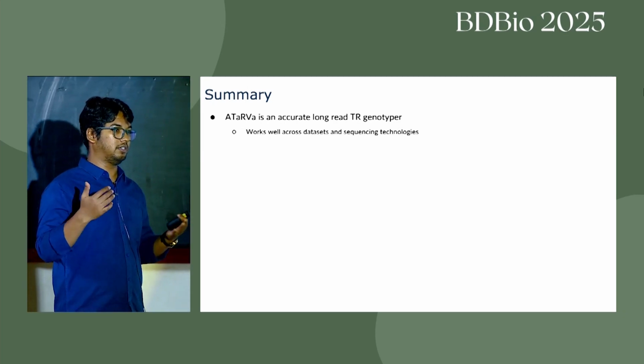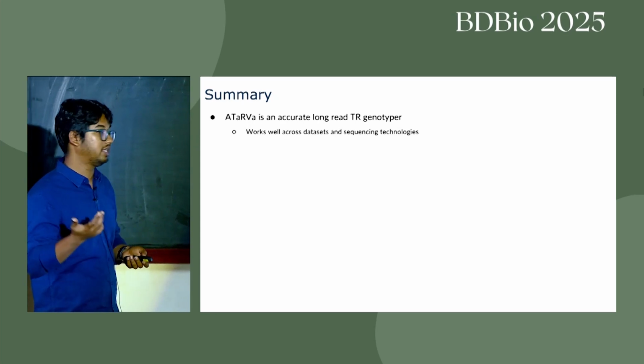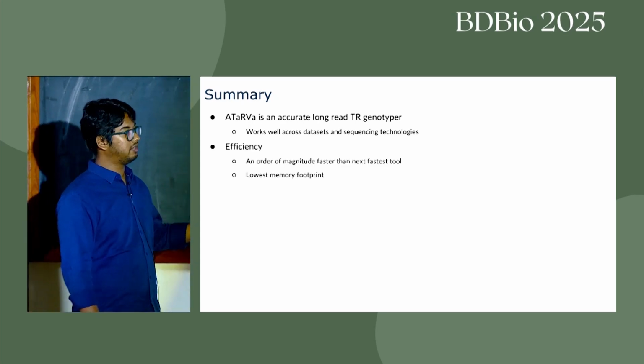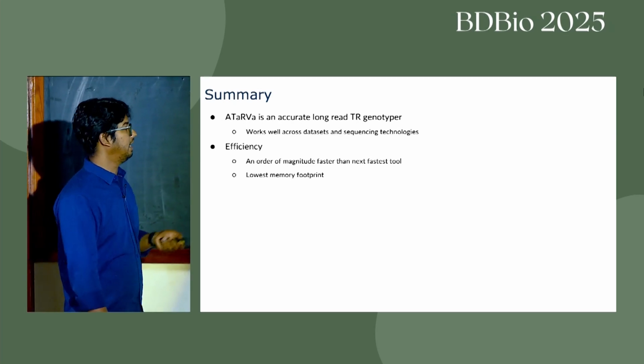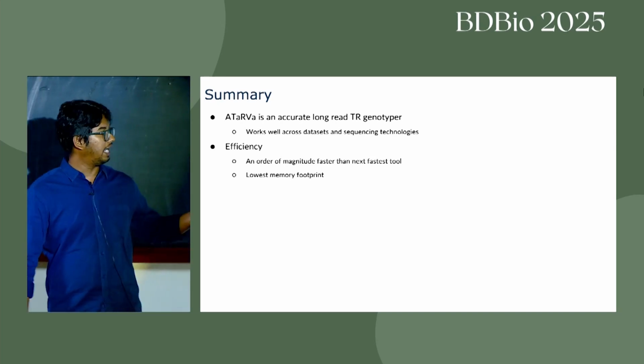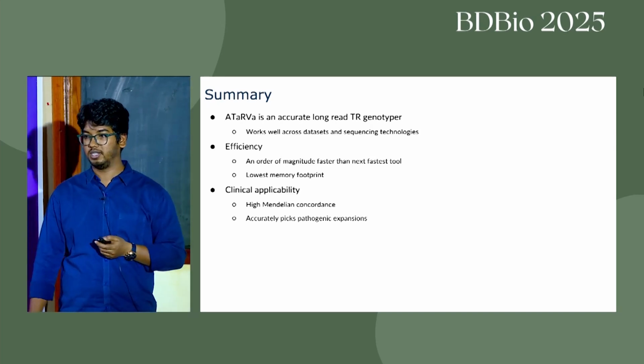But of course, it does not genotype as many loci, but the accuracy is quite good. I showed that despite the accuracy, we are very efficient. I showed that it runs almost an order of magnitude faster than the next best tool. And it also had the lowest memory footprint on the tested data set.